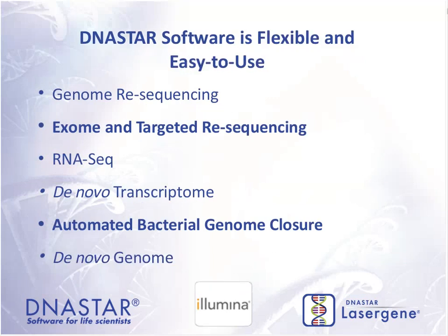The software is also very flexible. It can accommodate a wide array of different workflows. There's actually a number of different algorithms that help support the different workflows. That includes genome resequencing, exome and targeted resequencing. And of course, with targeted resequencing, that could be a handful of genes, a few hundred exons.